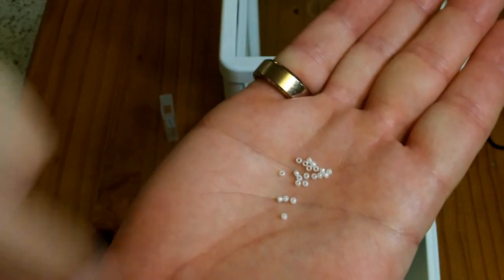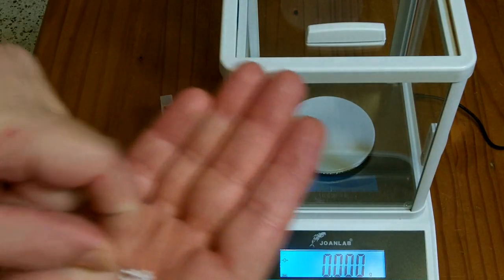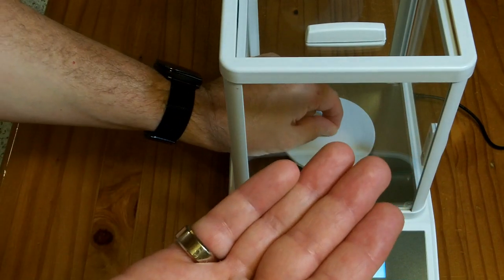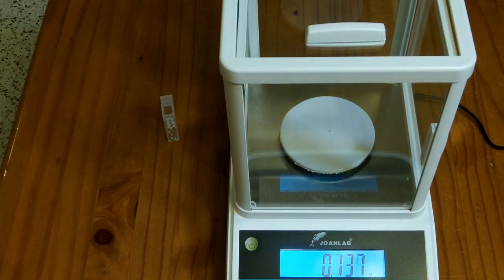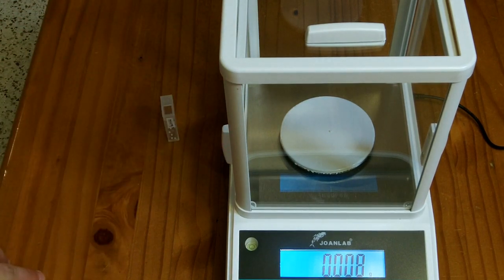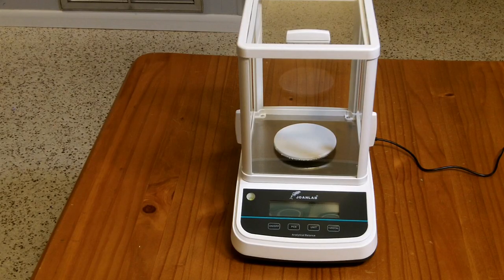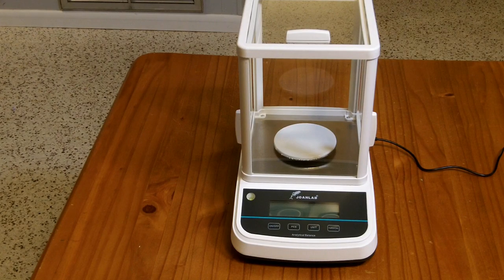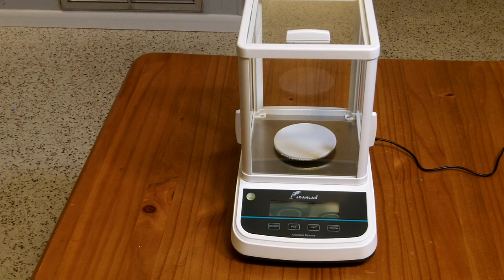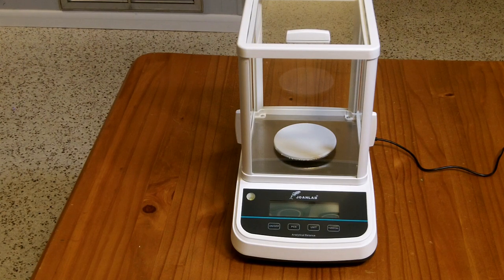So it worked perfectly on the little screws. With these super tiny beads, it was off by one. To put that in perspective, let's see how much one bead weighs. I'll remove some of the wind as well. So it looks like a bead weighs one one-hundredth of a gram. Now I just generally love being able to measure things very precisely and accurately. So this is a really cool scale. Do I need to measure many things this precisely and accurately? Well, probably not. But if you do, this guy is probably going to be just what you need.